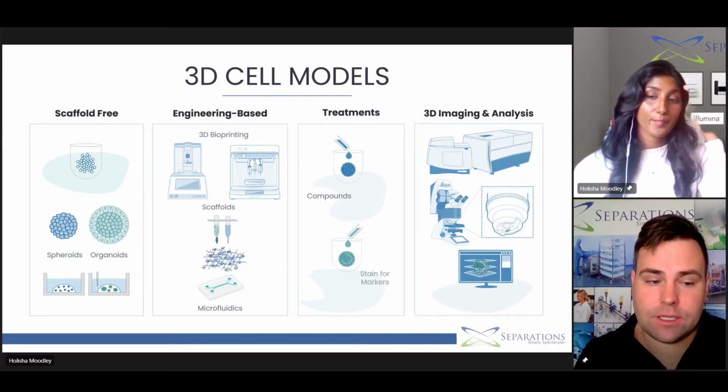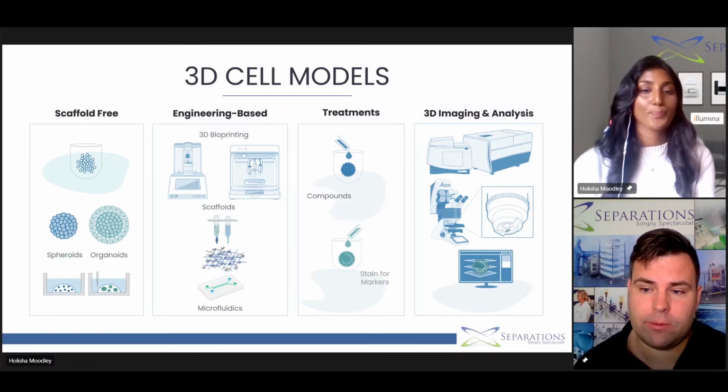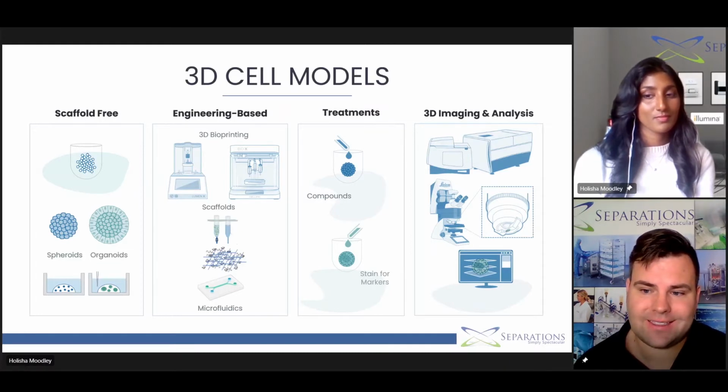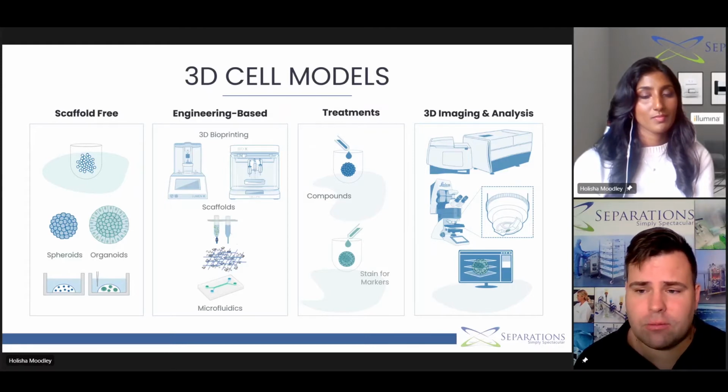Awesome. So I'm going to jump in there. The thing that I find the most interesting about spheroids is specifically its clinical use, and especially drug development. When we talk about phase one, there's often a requirement for animal models. That's still the regulatory requirement, but there is a strong push by multiple researchers in the clinical space to try and establish the spheroid model as almost a preferential next step in terms of potentially circumventing animal models. It is still a requirement from a regulatory standpoint. However, there is some openness from regulators globally to start considering the viability of these models for more accurate in vitro modeling that correlates to a large degree to what they expect in vivo.